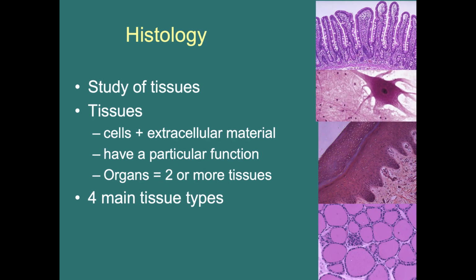Let's spend the last good bit of our lecture today looking over histology. Over here on the right side of your screen, you can see all these different types of images. So these are all different types of tissues, and by the end of today's lecture, you should have a pretty good understanding of how to identify this tissue.